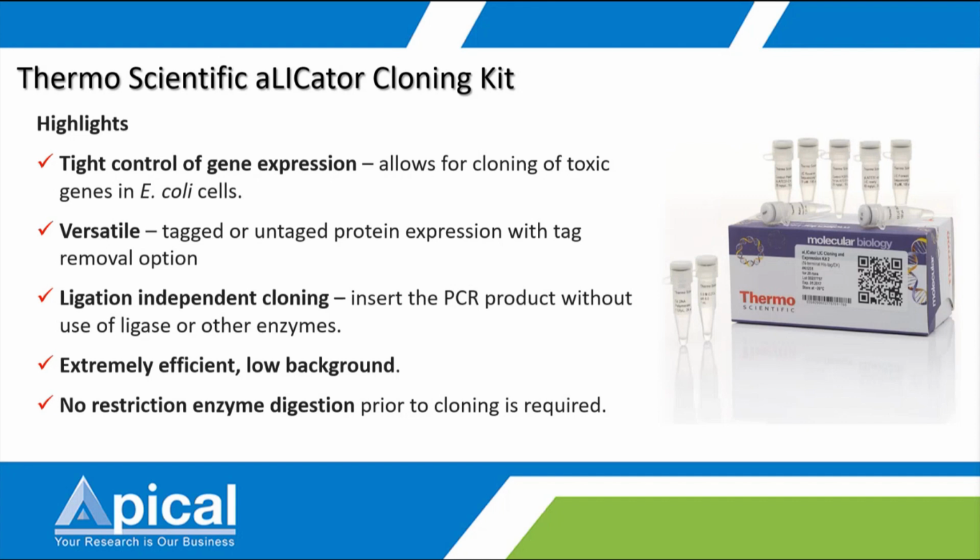For example, in some studies the gene of interest may produce a protein that is toxic to the cell. If expressed at a high level, you need to control the expression of this gene so that it won't be expressed too much in the cell and kill the cell. In that case, it is suitable to use this kit.